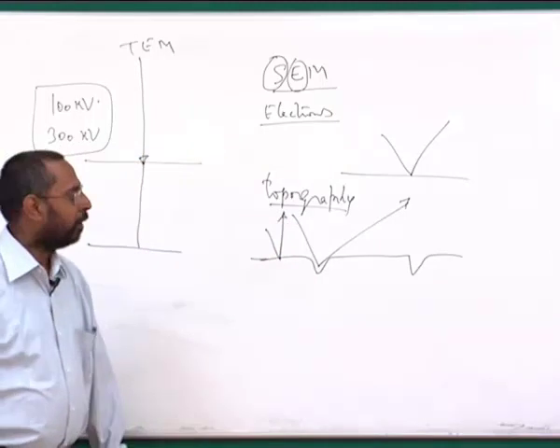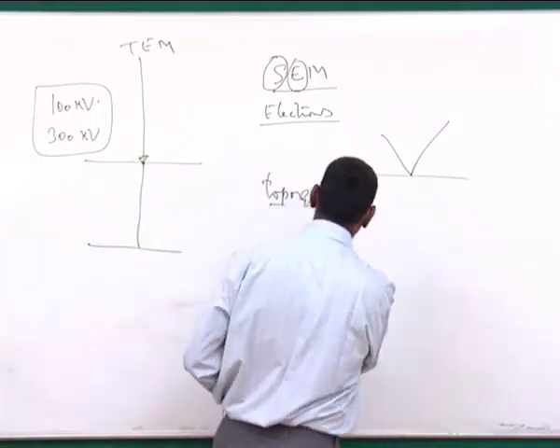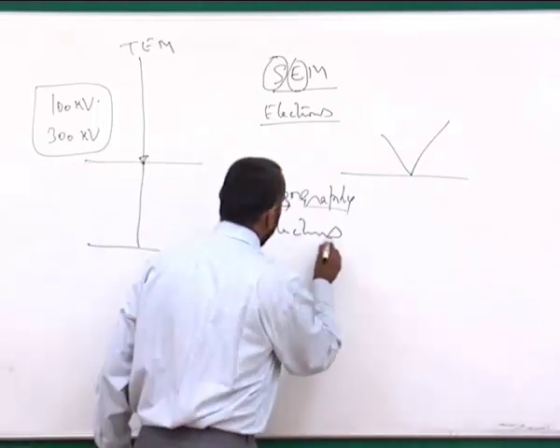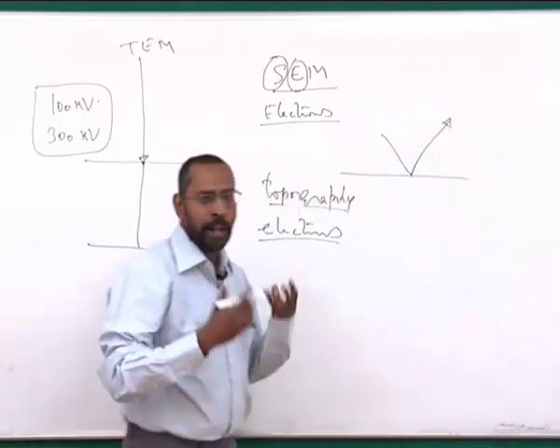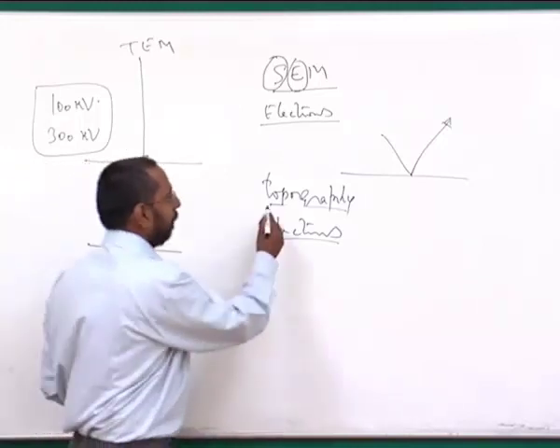Whereas in the case of a scanning electron microscope, you would see these differences based on the electrons that are being scattered away from the surface, and looking at the number of electrons that are being collected back by the detector. Depending on the intensity of the electrons that are coming back, you will see a contrast which is different for different regions depending on the depth.